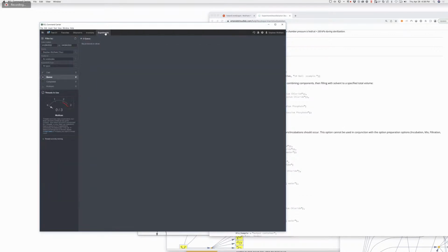Okay, so now I go to experiments. Exactly, and now you should have one in your cart because you haven't purchased it yet. It's sitting there waiting to go. So what does that mean? I go to cart. Yeah, go ahead and click on cart. And there it is. If you click on that now, I think you should get a button to accept it. There you go. Confirm protocol. If you do, that will legitimately go make it in the lab.